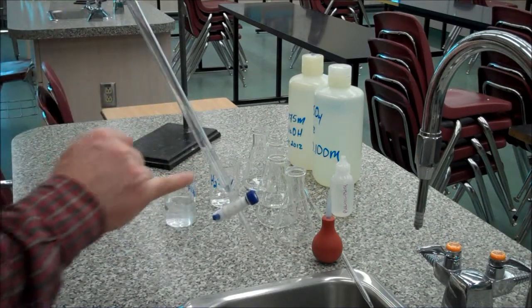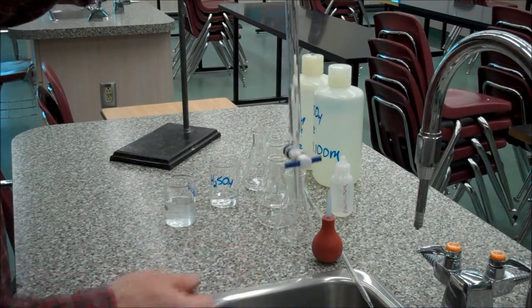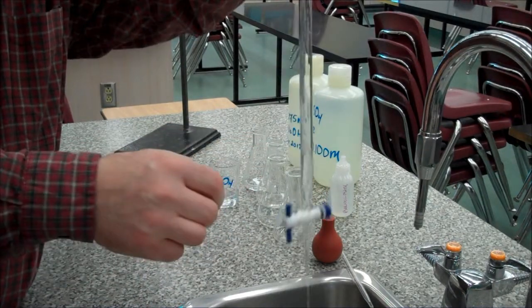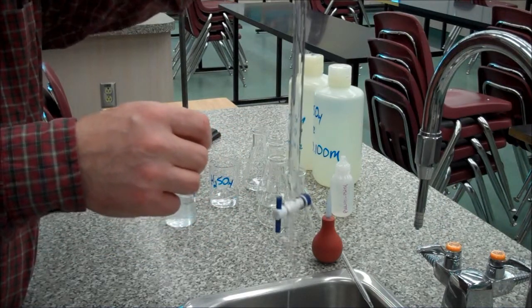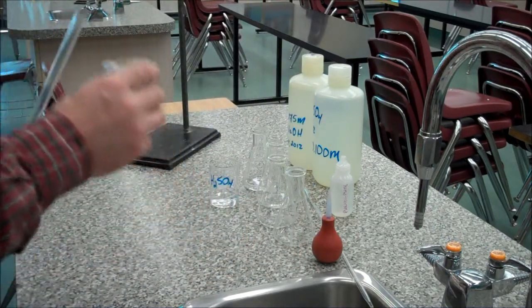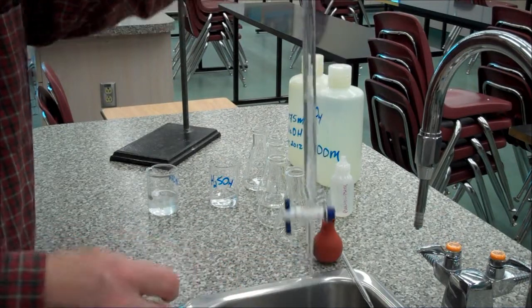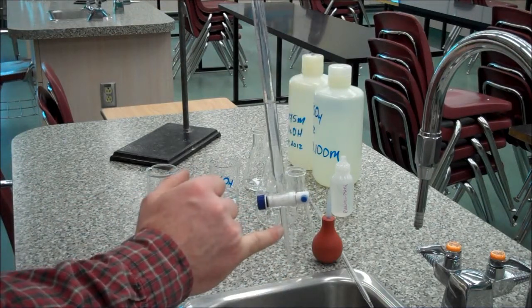Okay, so maybe you can see that there's some up in here. It's on the graduations. Now, so this is the rinse, the equilibration. And so I'm going to turn the valve on full blast and it'll fill up this tip. And I might have to shake it to make sure the bubbles come out. Uh-oh, didn't have enough. Still have some bubbles. Get some more. You don't want to waste too much because we don't have a whole lot of extra. There's the bubbles going. There, they're gone. Now we close our tip. The tip is now rinsed, equilibrated, and full.